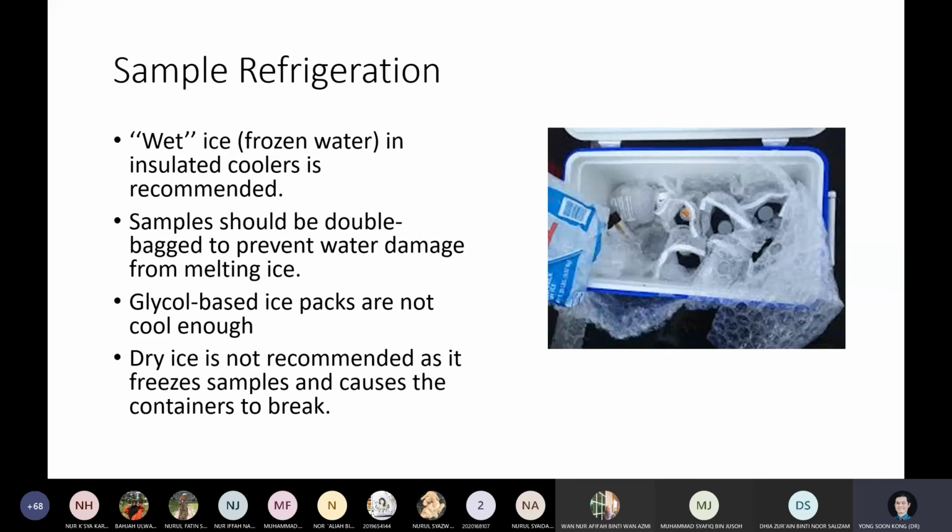So we don't use the resealable bag. Usually the containers that people use to store water samples are a bit rigid, quite durable against minor knocks and falls, so that they don't break apart. So we don't use soft plastic, we use hard plastic bottles. Once we have filled it, close it according to the requirements of the contaminants. And then what? Put another plastic bag, seal it again, and then put it in ice water.